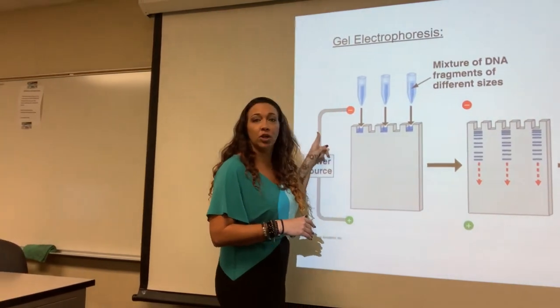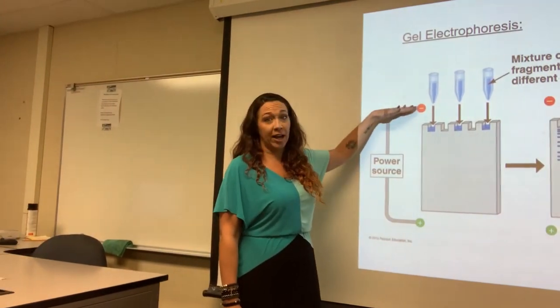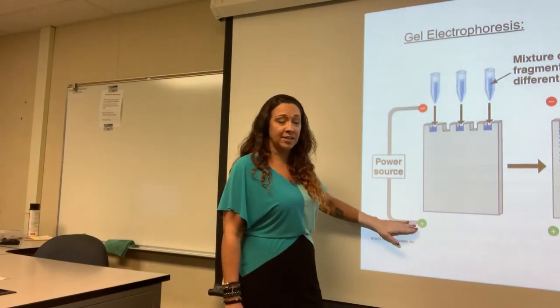You run an electrical current through it. It always goes from negative to positive. The negative end is the black end. The positive end is the red end.